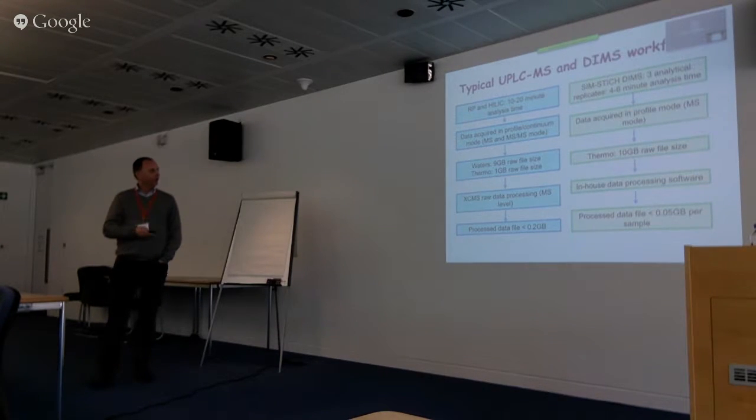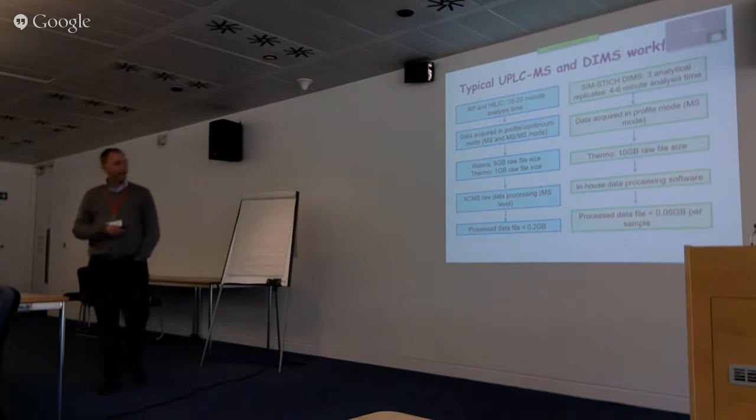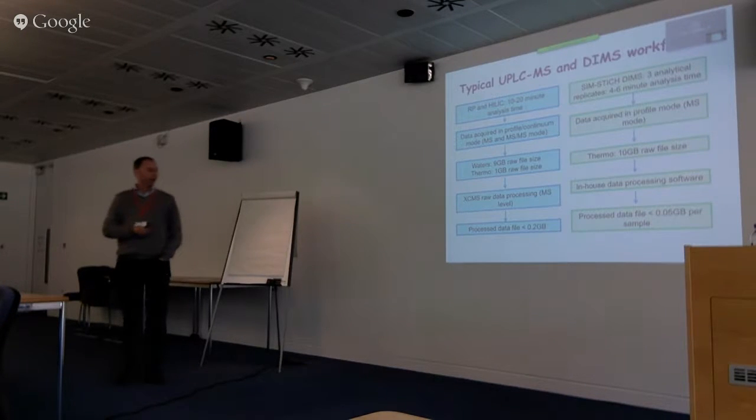So we're performing reverse-phase data acquisition, very similar to the National Phenome Centre, for the LCMS. We're collecting in profile continuum mode, as we like to call it, both mass spec and MSMS data. Obviously, the MSMS data is much less data intensive than the full-scan data. You heard about reductions in noise; well, Thermo is one of those companies that do that.